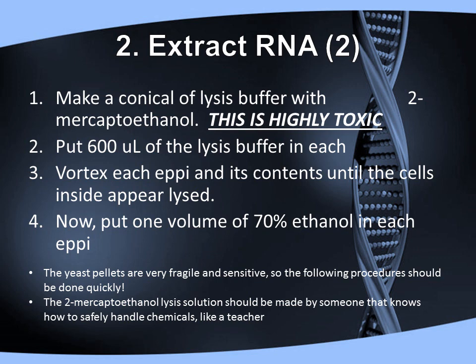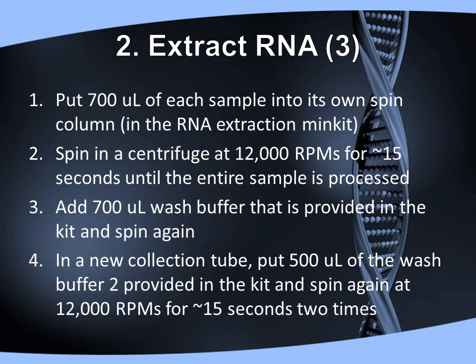The mercaptoethanol lysis solution should be made by someone who knows how to safely handle chemicals, like a teacher, as it is very, very highly toxic. Continuing further, we put 700 microliters of each sample into its own spin column in the RNA extraction mini-kit.